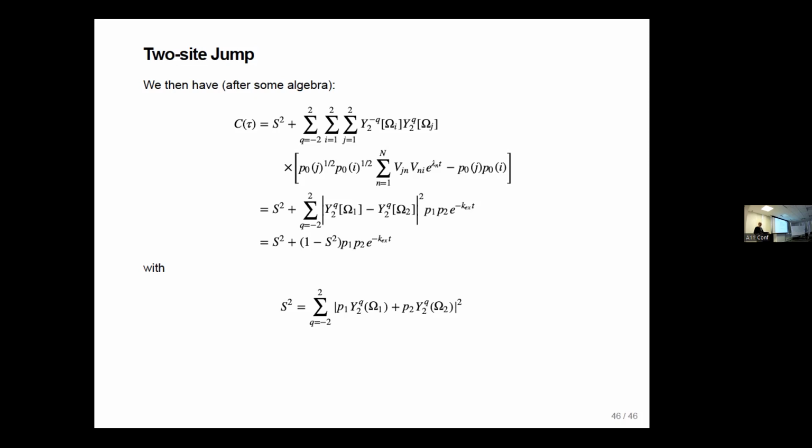We have expressions for the rate constants, and now we know something about the spectral density functions. So our other issue is what happens when we're not in the Redfield limit. And that leads to relaxation dispersion, Bloch-McConnell equations, stochastic Liouville equations. So that has to come up in the future. That may be after the ENC, because I'll be at the ENC.